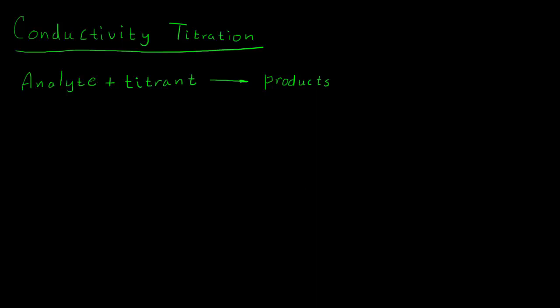Hello, this video is about doing the calculations for the conductivity titration. So let's talk a little bit about the background theory first, just so you'll understand what's going on.